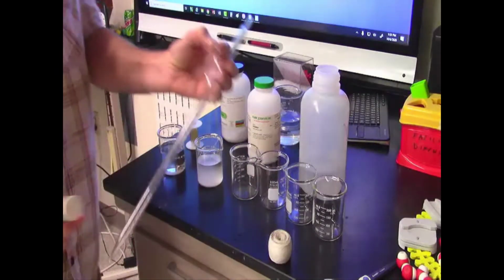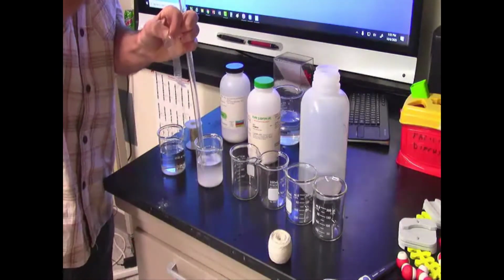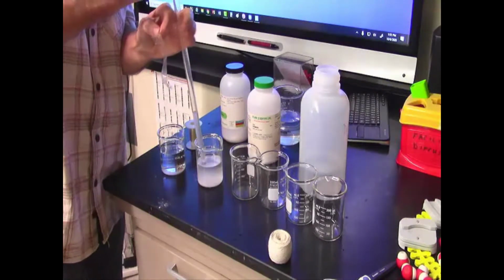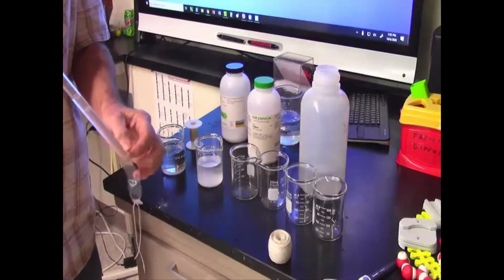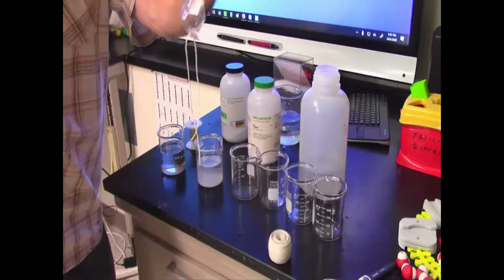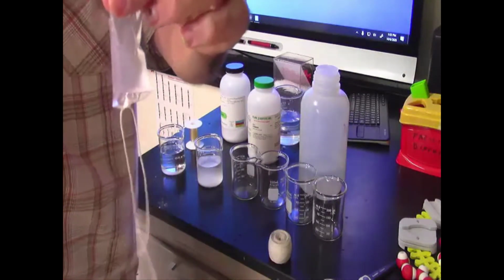Okay, I'm going to do the same thing with starch. I got a brand new pipette, it's all nice and clean. Put it in my pipette bore and suck up some of this starch solution, polysaccharide, in water, about the same amount. It doesn't matter, we're going to go by percentage of change, and I'm going to squirt the starch solution into my fake cell.